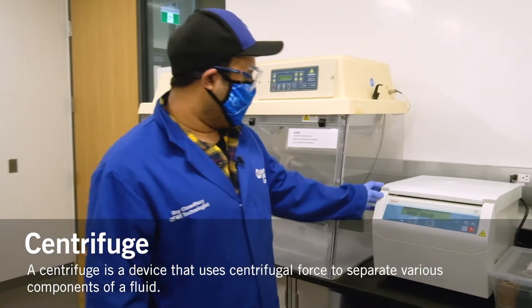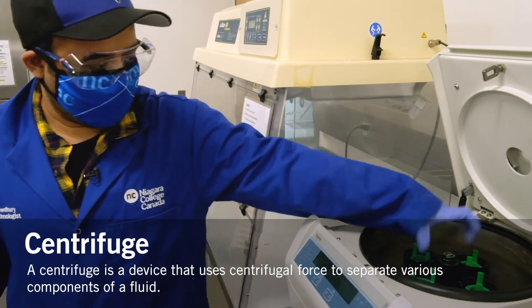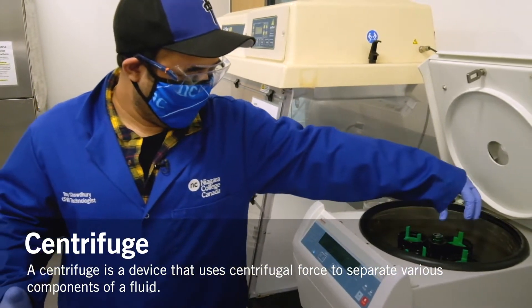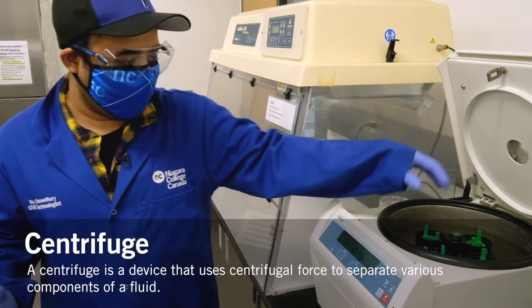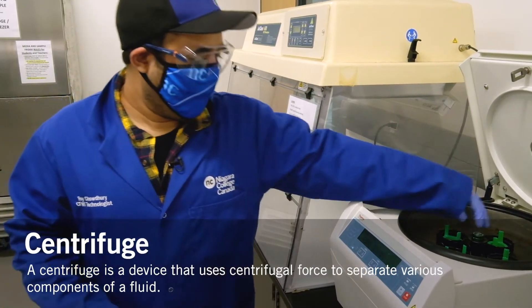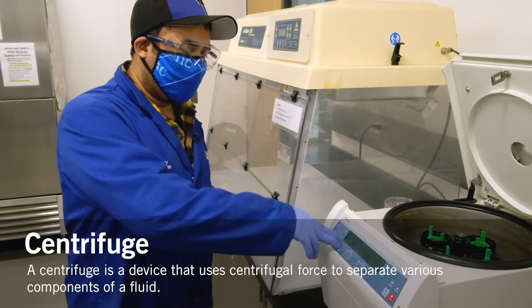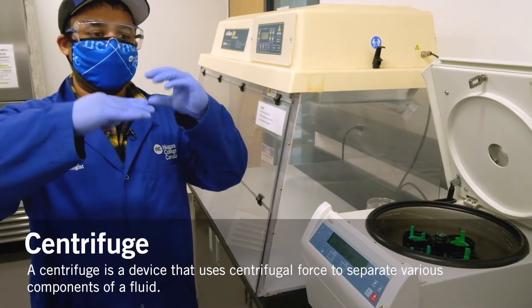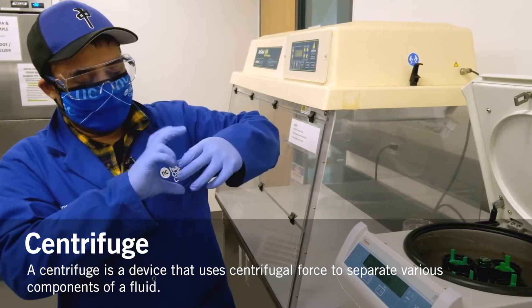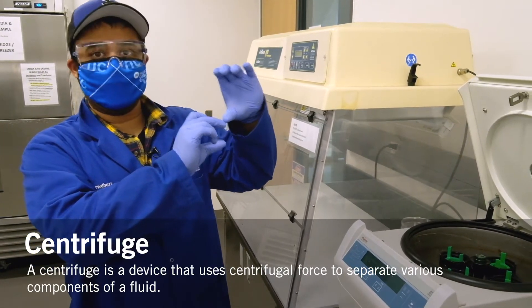This is the centrifuge — very expensive equipment. One thing to remember with the centrifuge is to always have two different samples that are the same weight when balanced. For example, if one compartment is five grams but the other is one gram, it's going to topple over. Just like a washing machine, always have the weights evenly distributed. What this typically does is — if you have muddy water and you put it in the centrifuge — it's going to separate the soil element from the water element, giving you two different layers: one soil and one strictly water.